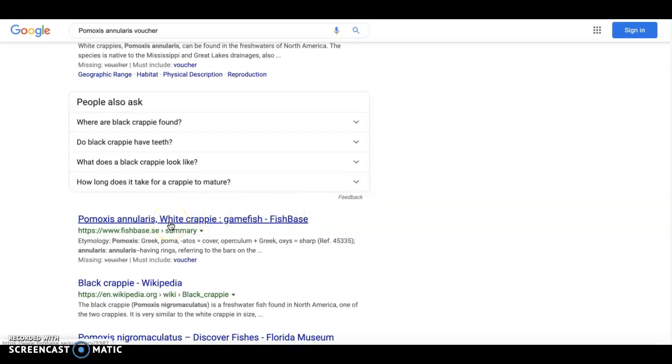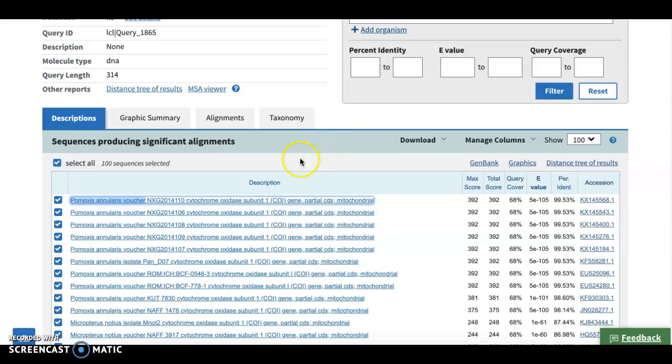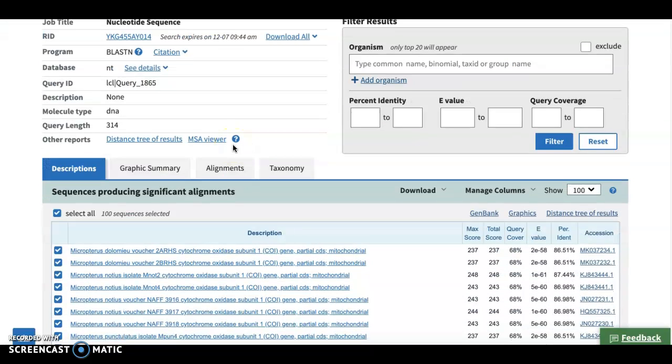So we would check the database, go, okay, that fish sequence is of white crappie. So the database, the BLASTing information tells us whoever had that sample, your sample said your fish is crappie, that white crappie. So was that your hypothesis? Did you hypothesize it was white crappie, or was it possibly something else? So use this, take a look at it, see if your hypothesis panned out.